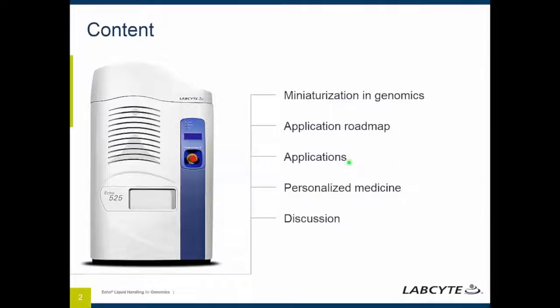For me, as an application scientist, I'm not just interested in moving liquid, I'm also interested in the solutions that are created. More specifically on applications, I'll discuss how the Echo liquid handler can be used for genomic research, including genotyping, synthetic biology, and library preparation for next-gen sequencing.